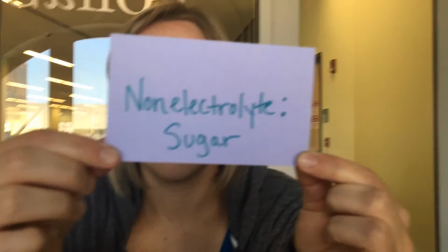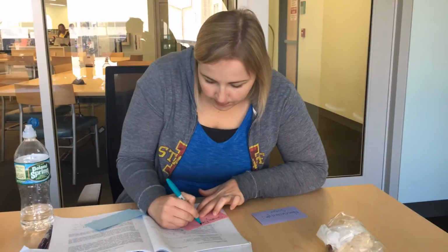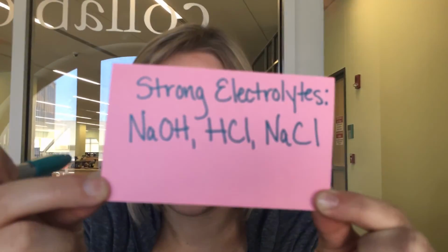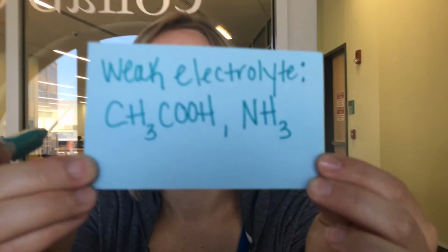After completing the conductivity tester with our 6 sample solutions, we determined that sugar is a non-electrolyte. Our strong electrolytes were NaOH, HCl, and NaCl, and our weak electrolytes were CH3COOH and NH3.